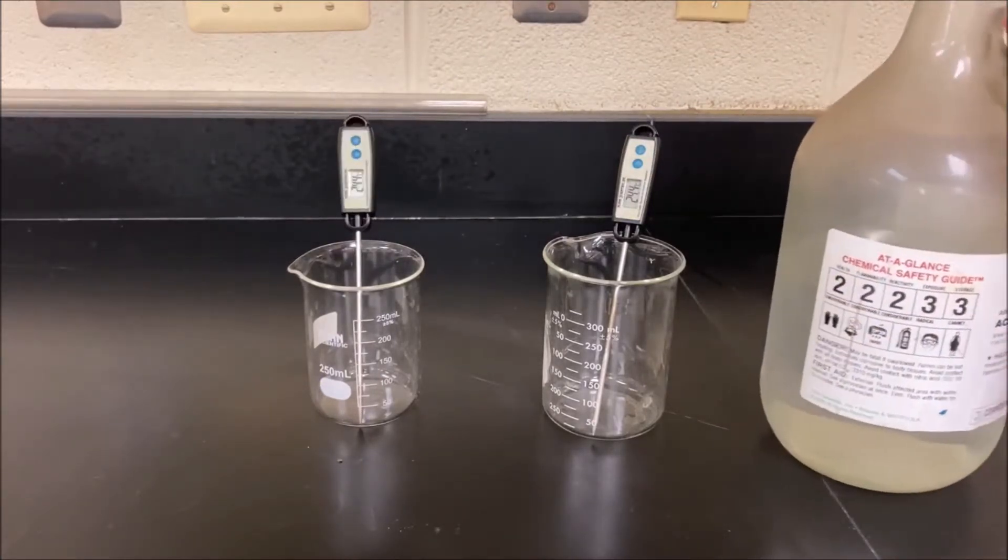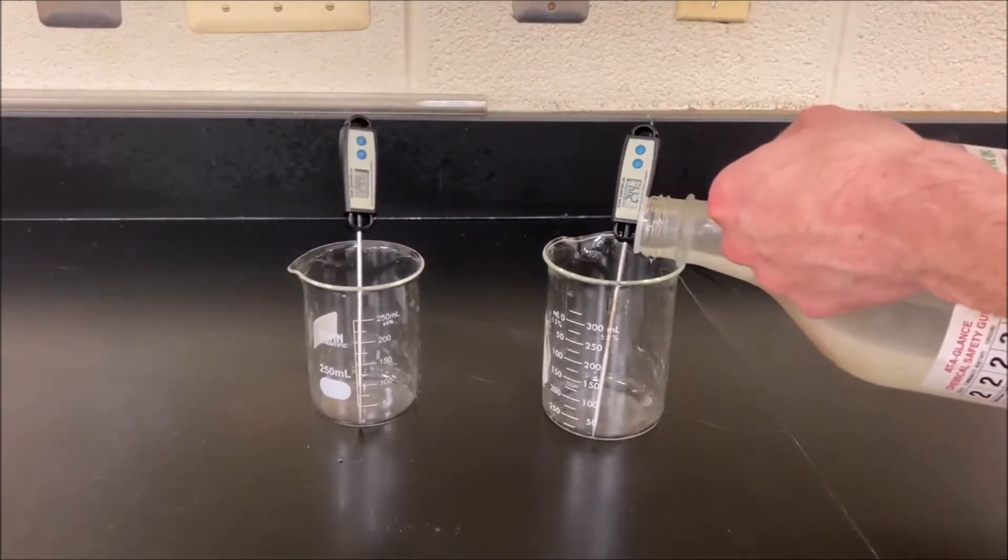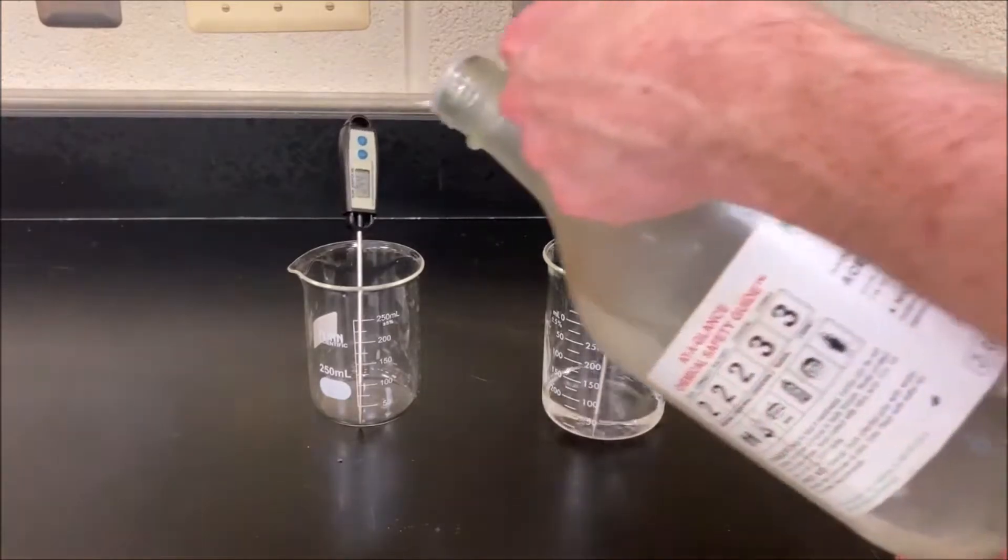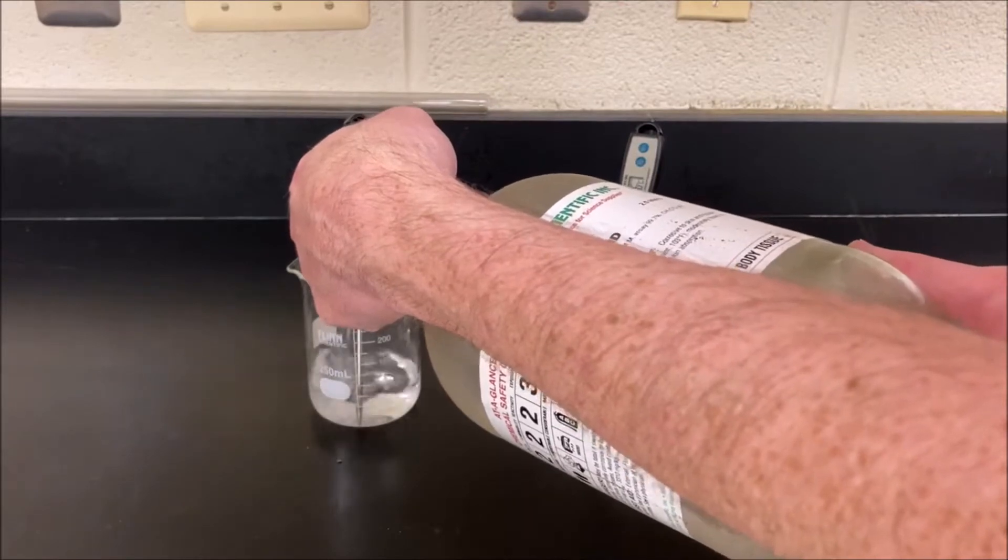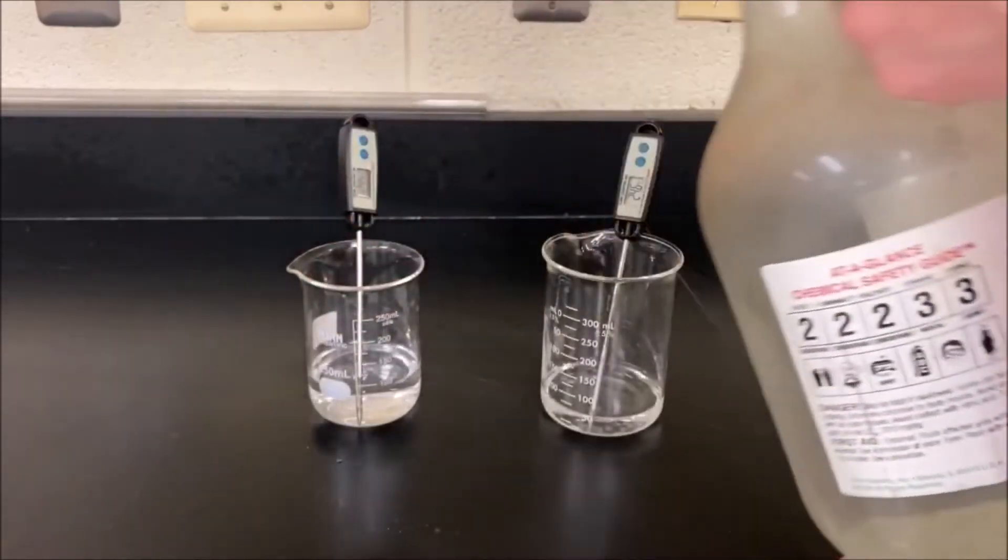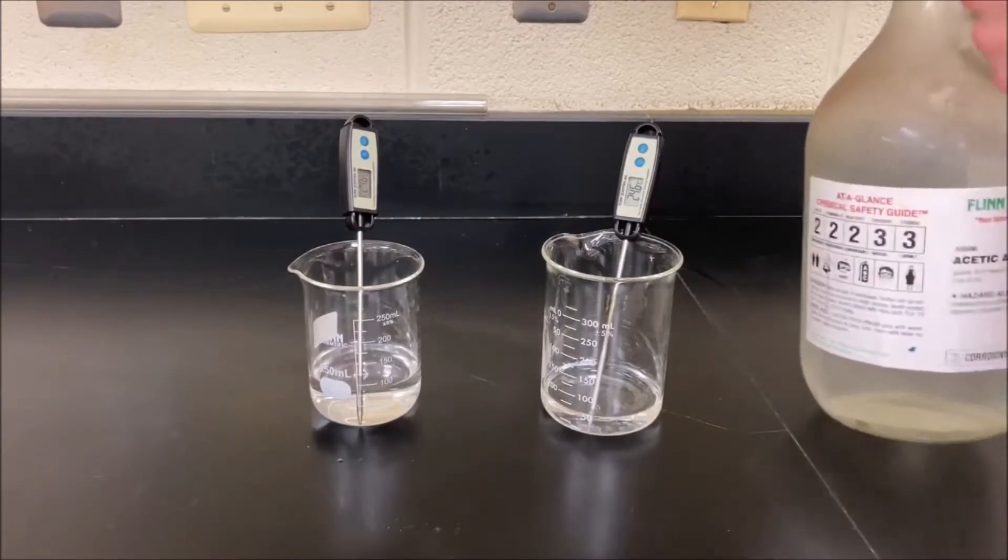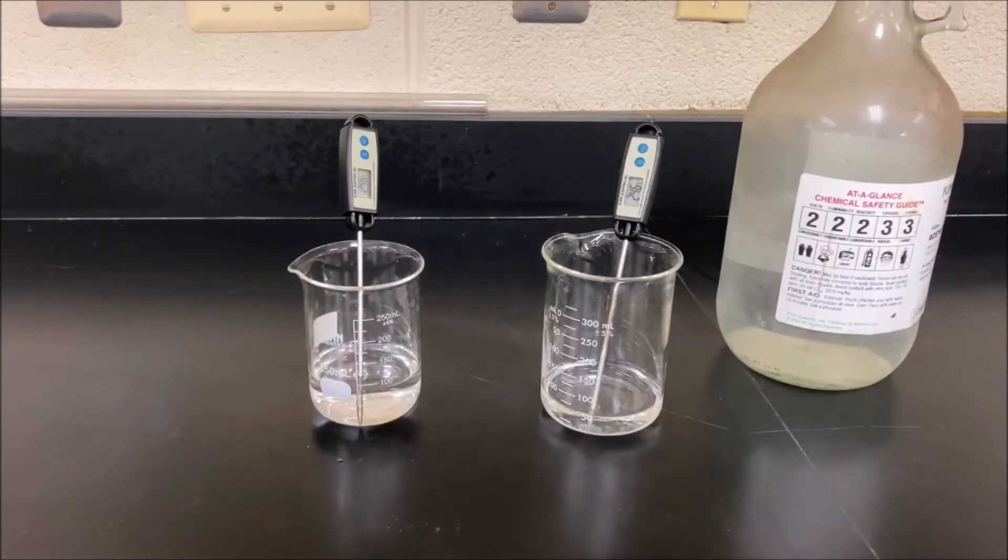So what we're going to do here is we're going to pour some of this into these two beakers and place these in the fridge and freezer. Let's see if we can get this to freeze and then we're going to look at what happens when it melts and what happens when we take frozen glacial acetic acid and mix it with some baking soda solution.